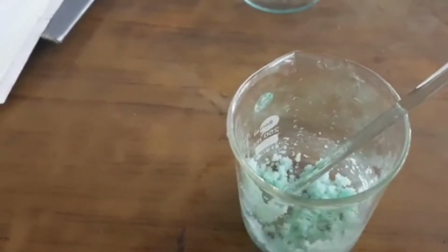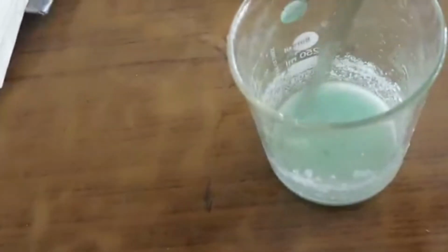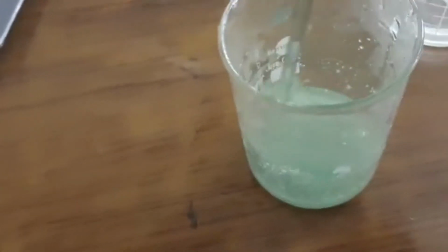Add water in small amount, slowly mixing. We are going to try making a solution in minimum quantity of water. Slowly adding water to this. Dissolving the contents in minimum quantity of water. So this is a clear solution, and now we will filter this solution into the china dish.